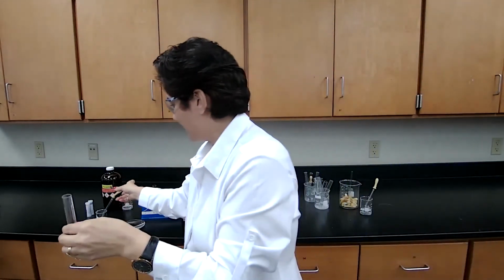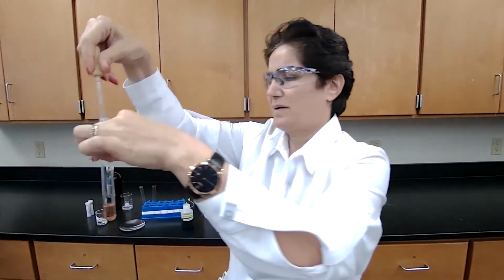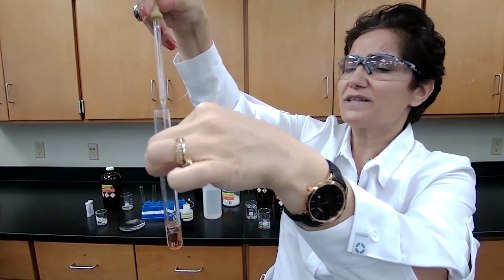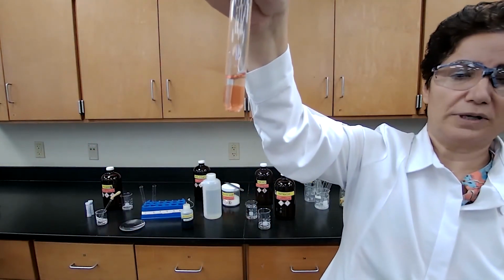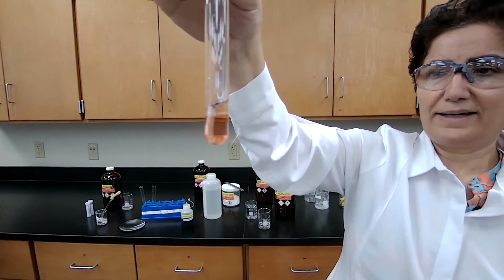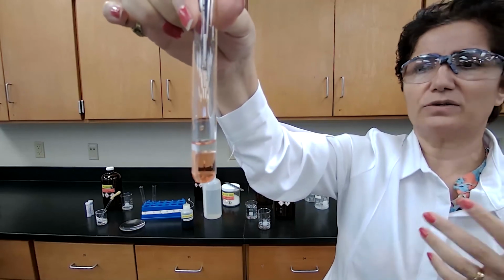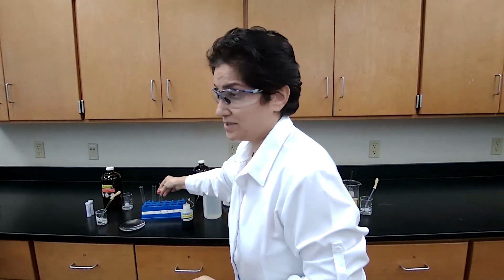Okay. Now I'm adding unknown to the HCl. If it dissolves, it would be one layer. And if it doesn't dissolve, it would form 2 layers, 2 shades of the color. Please record your observation. And if the instruction at any point asks you later to take a screenshot, you will take a screenshot. So this is the solubility of unknown in HCl. We are done with the solubility part.